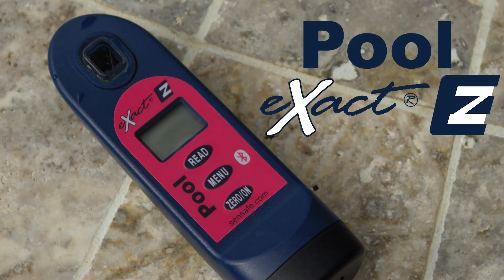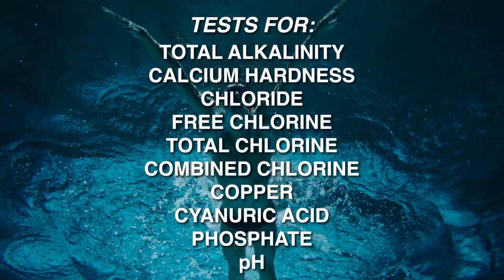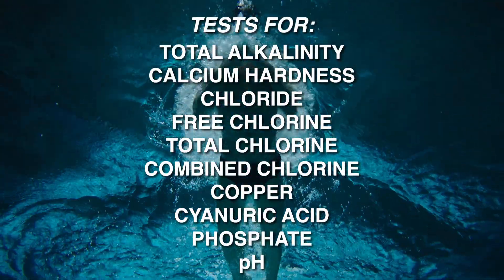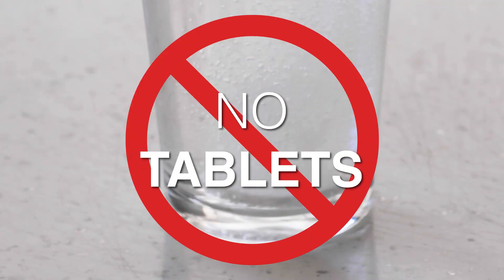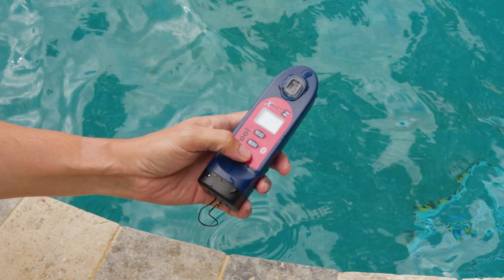The Pool Exact Easy Photometer delivers lab quality results in seconds. Tests for 10 key pool parameters are at your fingertips using our handheld, glass-free meter. No tablets, no powder, and no more color matching — just one easy, accurate digital reading.